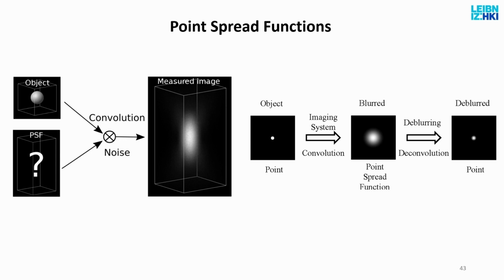Now, how do I go from this to that? Luckily, there is a mathematical step or function called convolution, which is basically, like I said, a smoothing function. You have the smoothing pattern, and you move it through the image step by step, pixel by pixel, smoothing it, which will turn this object into that object.